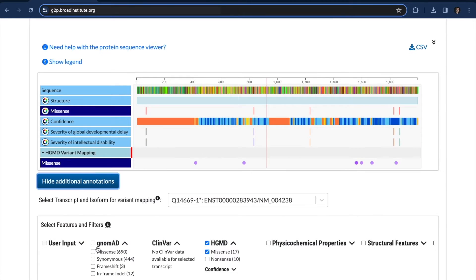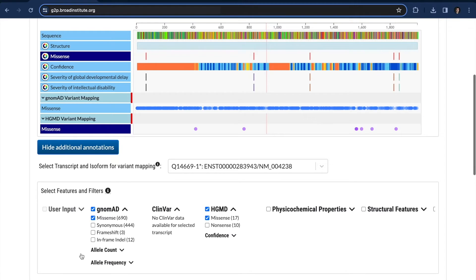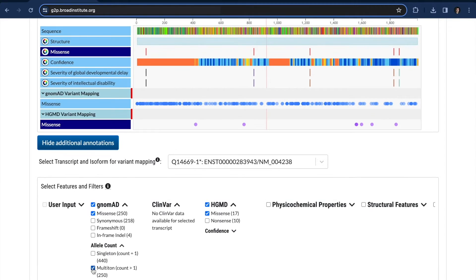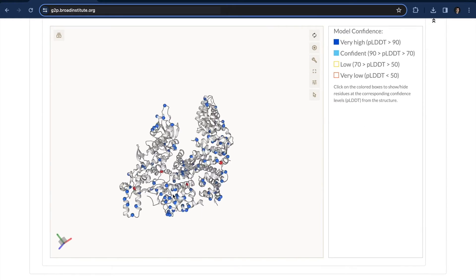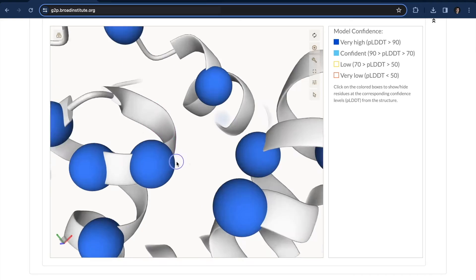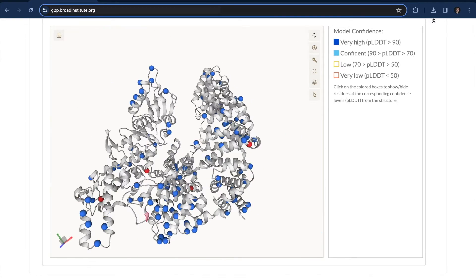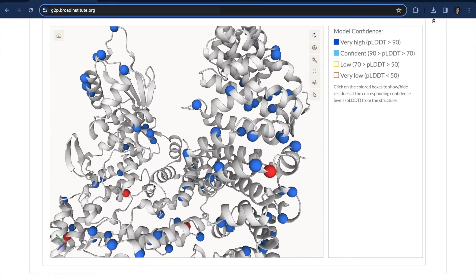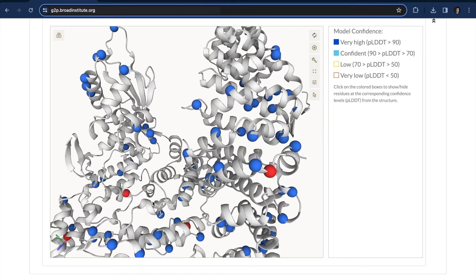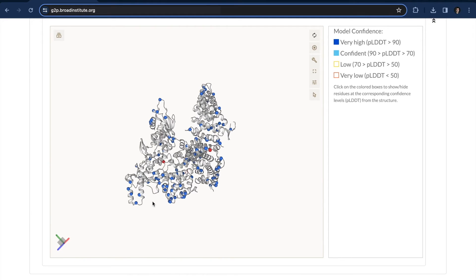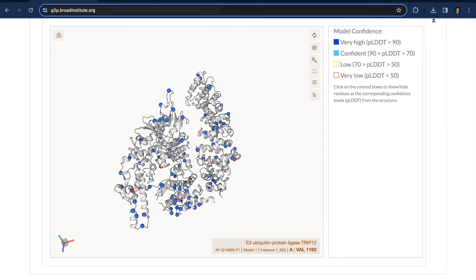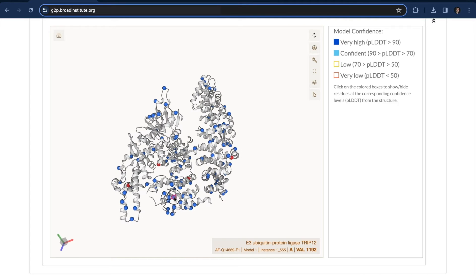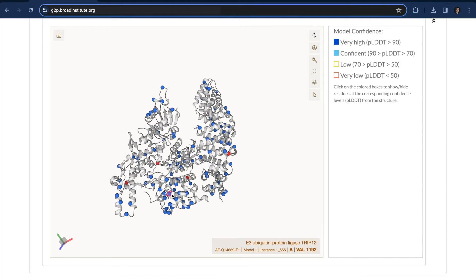Let's look at gnomAD. gnomAD is a database that keeps track of population variants. So those are variants from the general population, and when we map them, the variants are just about everywhere. I do see these empty spots in the core of the structure, which are right around our disease mutations. You can see that there are hardly any gnomAD variants in this middle area, where in comparison there are a whole lot of gnomAD mutations on the front surface area.